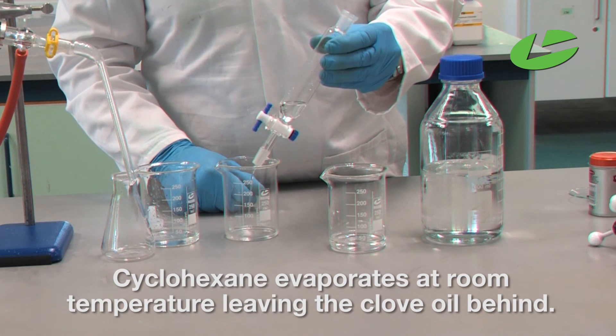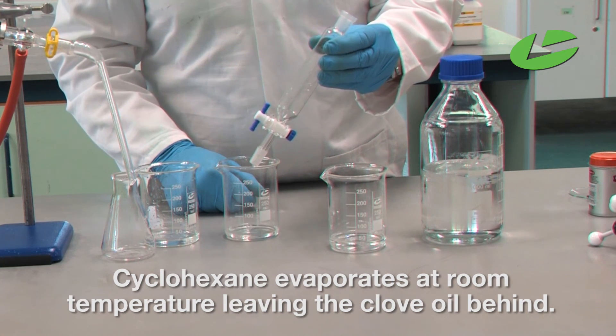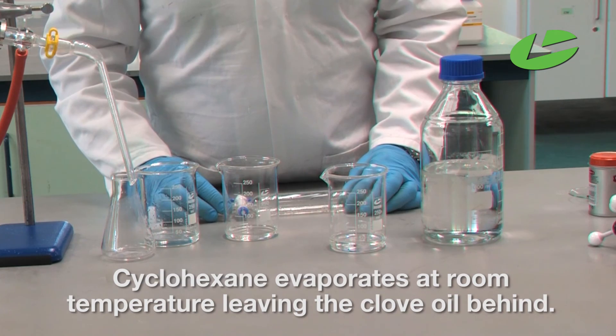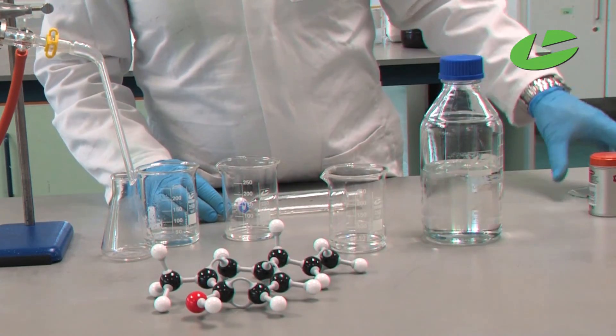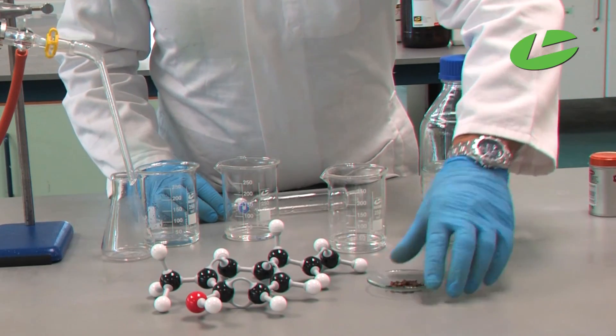Cyclohexane evaporates off at room temperature, so when I come back tomorrow morning all the cyclohexane will have evaporated and I will have totally isolated my eugenol from the cloves — giving a sample of pure eugenol from solid cloves.